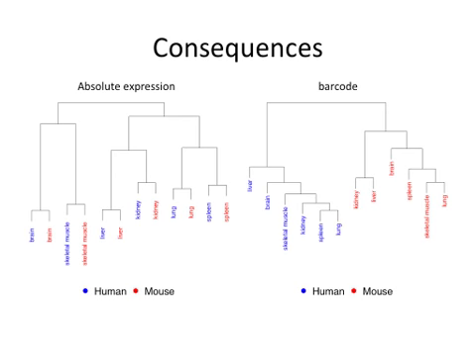So what do you think is happening there? This is a tricky one. Why is that happening? Why are all the human samples clustering with the human samples and the other ones with the other? Yeah, so there's two arrays, right?